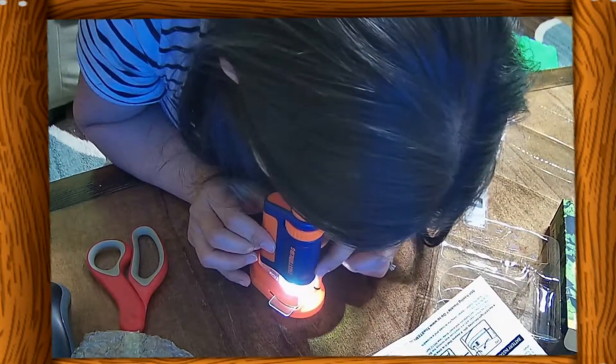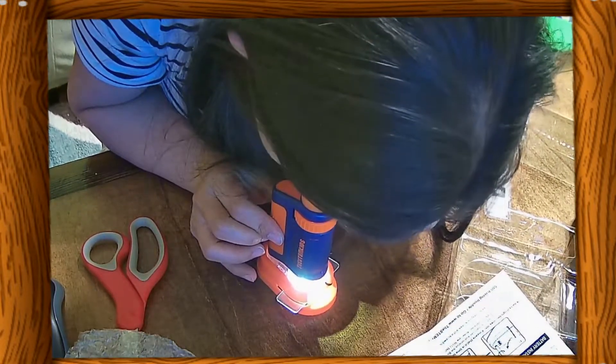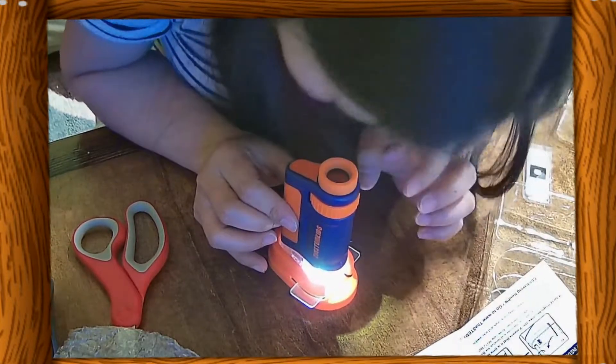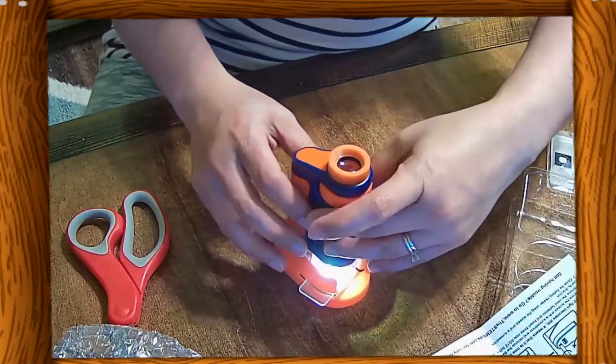I never owned a microscope when I was young, and I was amazed with what I saw. This microscope was very impressive for a beginner's microscope. And unlike more advanced microscopes, it is handheld and portable. I recorded a video using my cellphone to show you what the specimen looks like under this microscope.